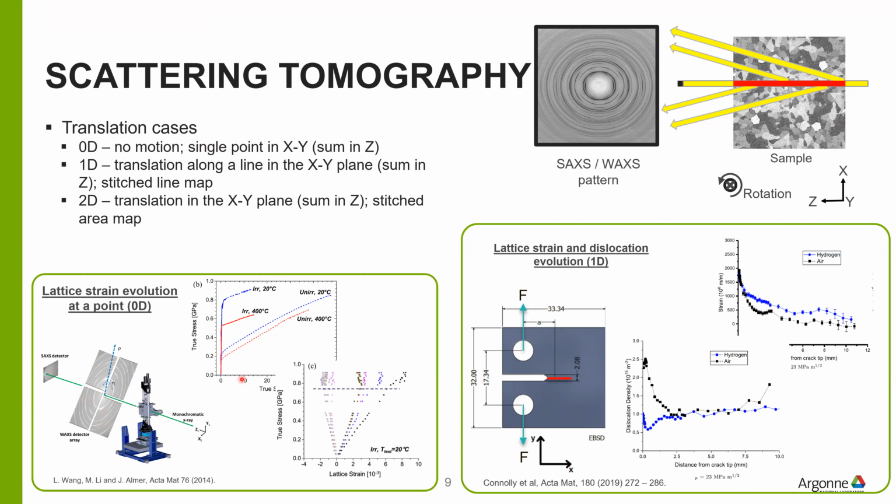And then see, for instance, as you apply some load on your sample, as highlighted by a stress-strain curve here, how do the strains in the loading direction and the transverse direction, if your sample is being loaded this way in the Y, change with applied load, right? So you just look at one point and then you keep measuring and you look at the strains and see if they break from linearity, what the inflection points are, et cetera.